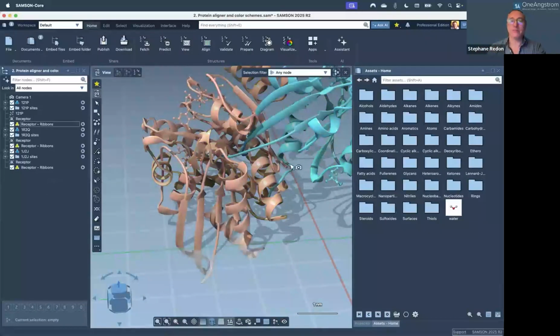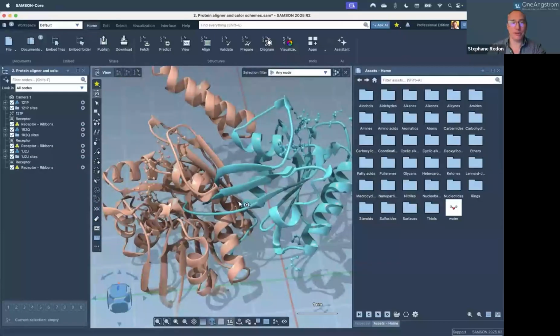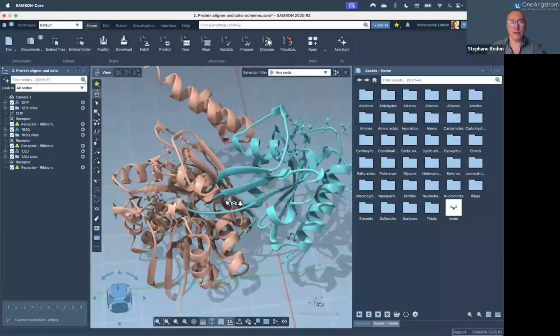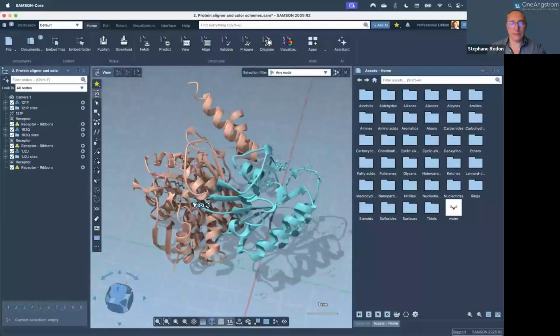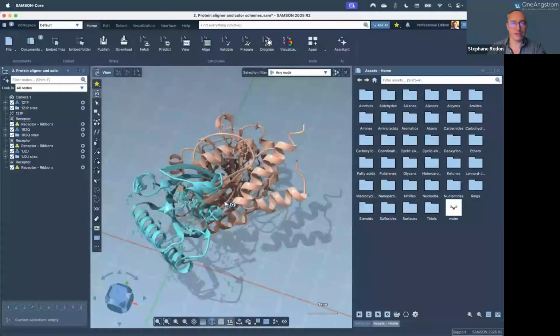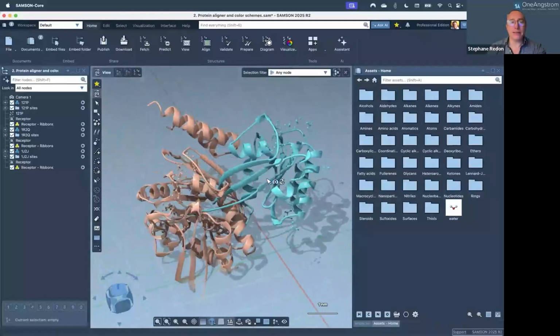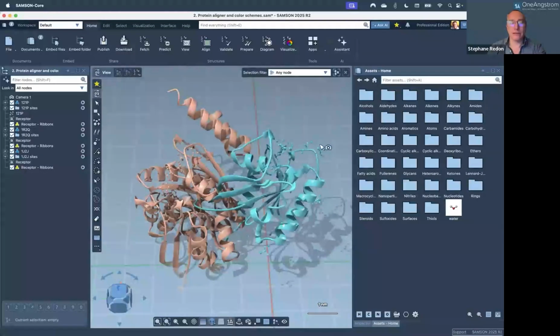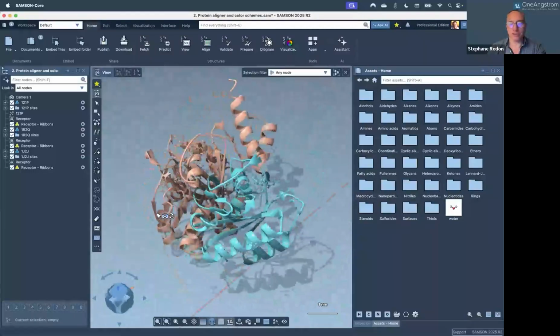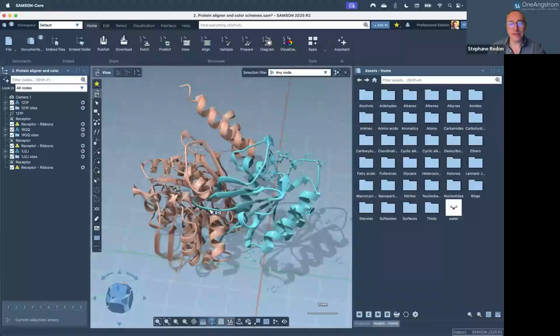So it's basically inspired by the PDB image of the month, molecule of the month feature on the PDB website, and by Goodsell style, which is super popular and super beautiful. So here directly I see better where ligands belong. I see which structure is which, etc. Okay. But I clearly see also that these structures are completely unaligned.